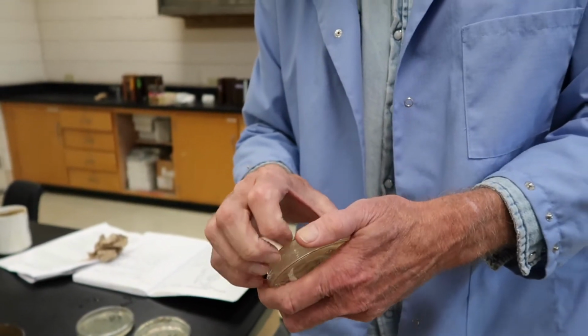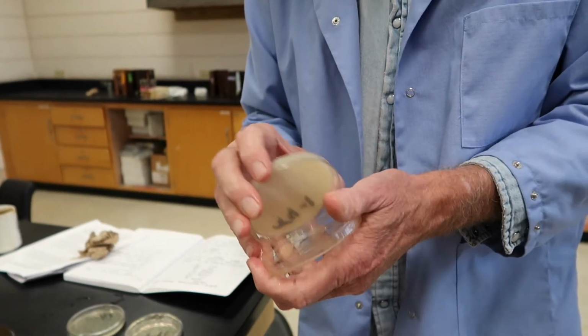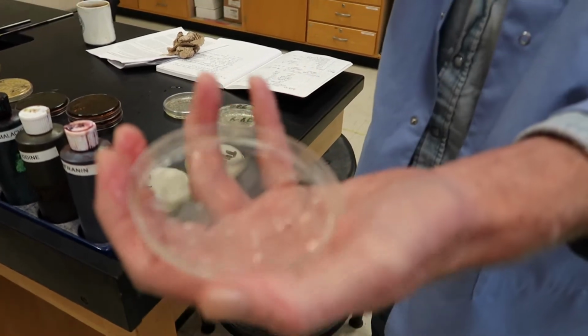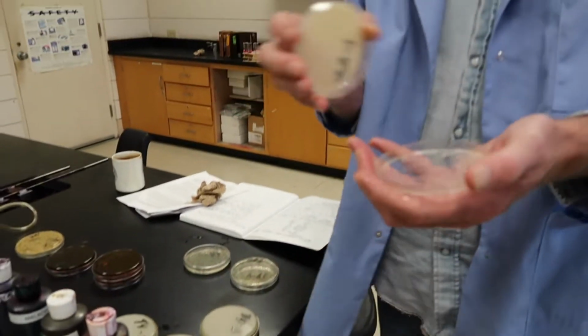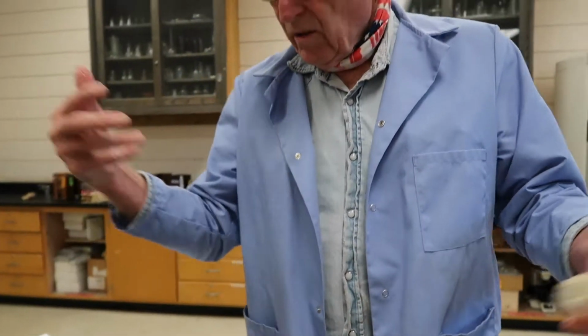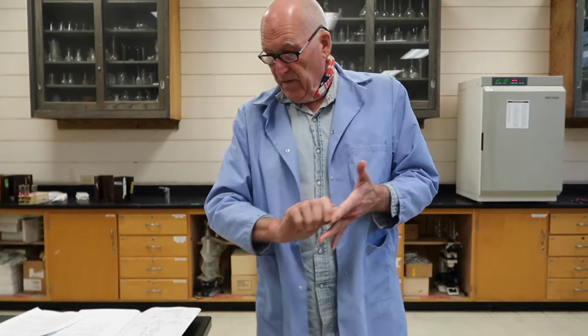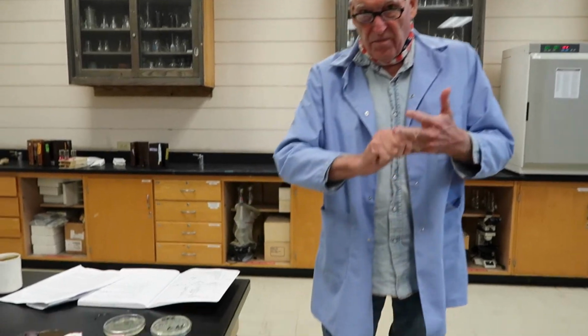It's so slimy that I can't hardly see. You got the same thing there. Huge amount of dextran. This is just a unique thing, so that's the only reason I'm showing it to you. And that's grown on sucrose media. That is real sucrose.